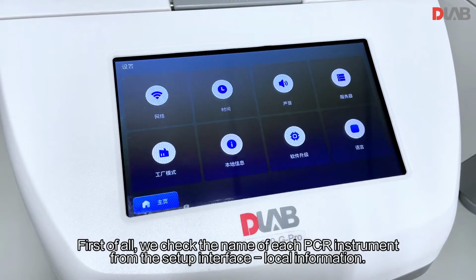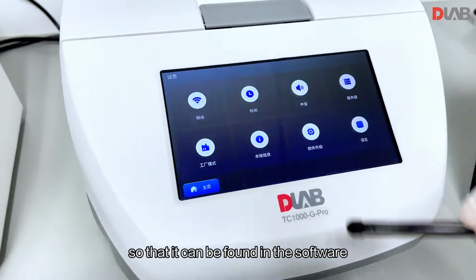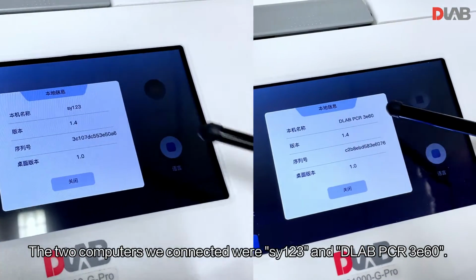First of all, we check the name of each PCR instrument from the setup interface, local information, so that it can be found in the software. The two computers we connected were.